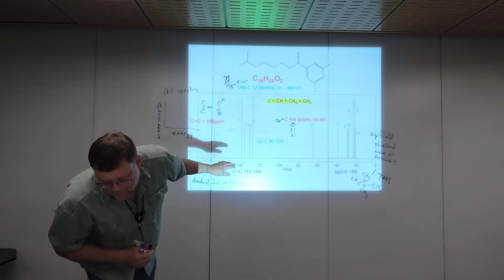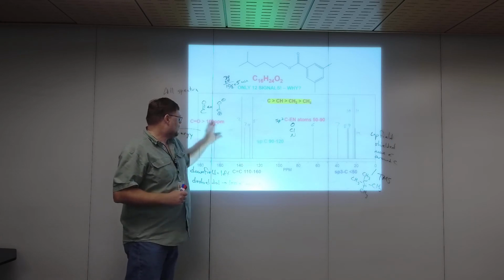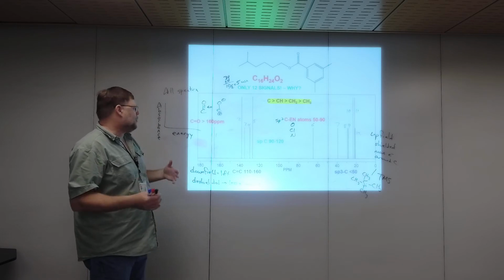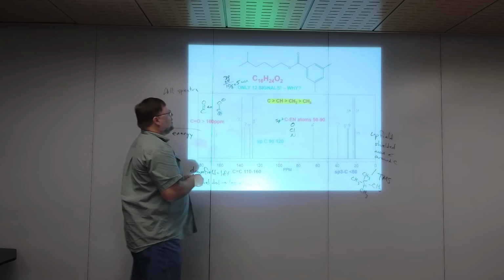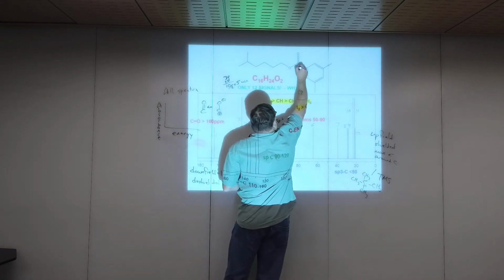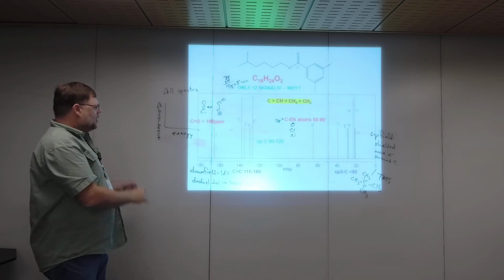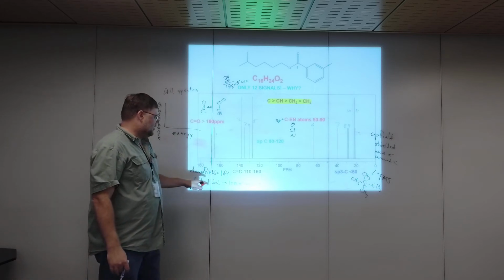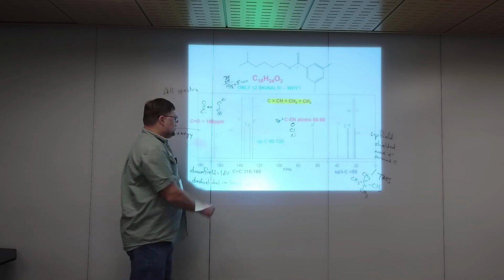So right here, we get information on chemical shift based on these color-coded things. So let's go through that. I probably should have done that first. Carbon 1 is going to be a carbonyl. We can assign that right now. We've got 1 carbonyl carbon, all the way downfield. Carbon-carbon double bonds, 110 to 160. There are 4.